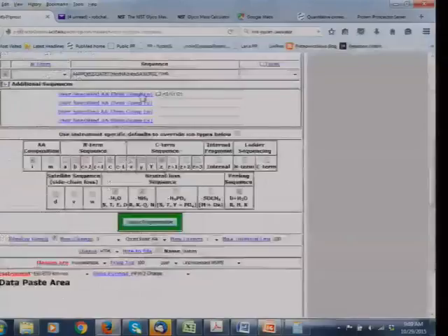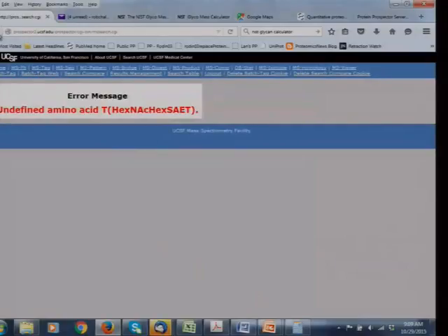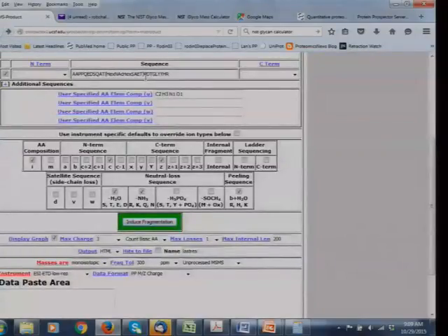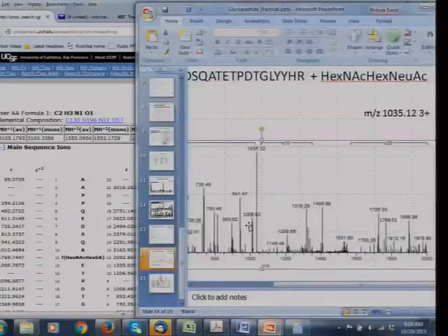I think I'll put it back on the other residue again. Oops. I can't copy and paste. So we saw this 1769, but the next fragment would be 1898. So we have another peak that's explained as well. So we've got there eventually.